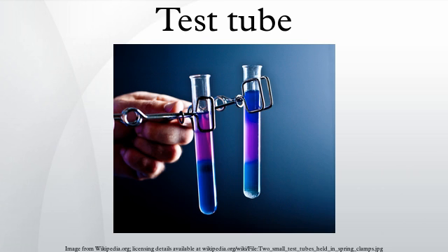Test tubes are usually held in special-purpose racks, clamps, or tongs. Some racks for culture tubes are designed to hold the tubes in a nearly horizontal position, so as to maximize the surface of the culture medium inside. Test tubes are sometimes put to casual uses outside of lab environments, for example as flower vases, glassware for certain weak shots, or containers for spices.